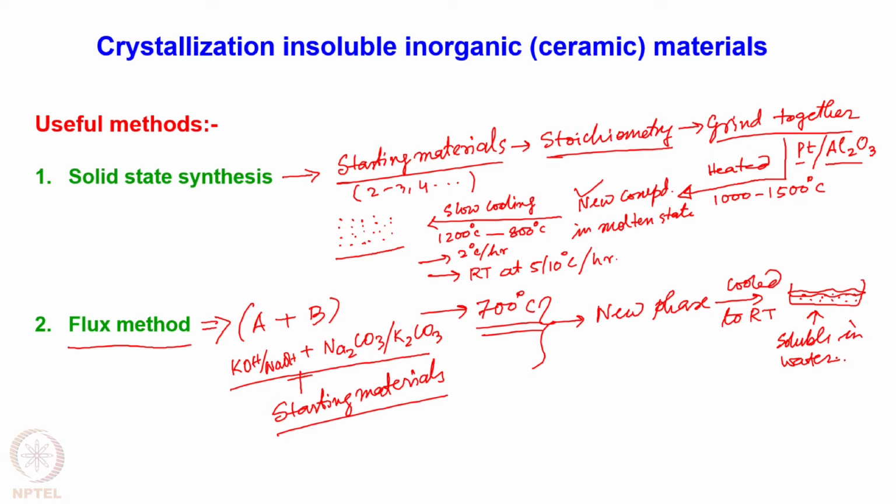So the flux that we have after this reaction mixture can be washed out, and the tiny crystalline particles that might have grown from your starting materials, which formed a new compound, new phase, can be isolated from this mixture.